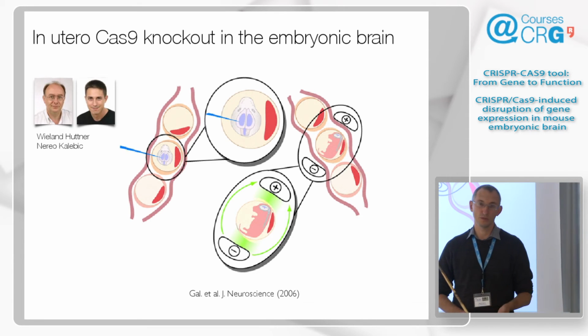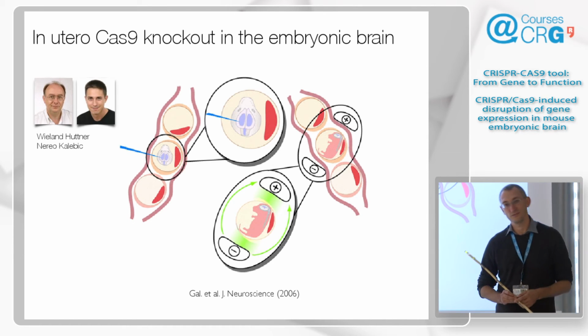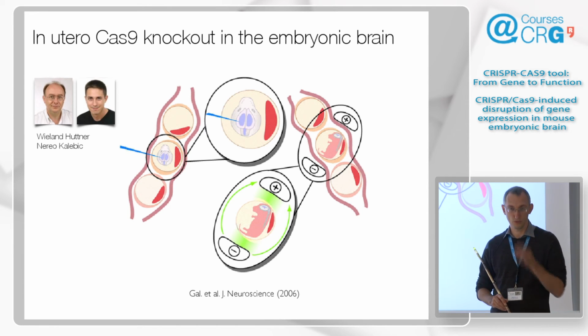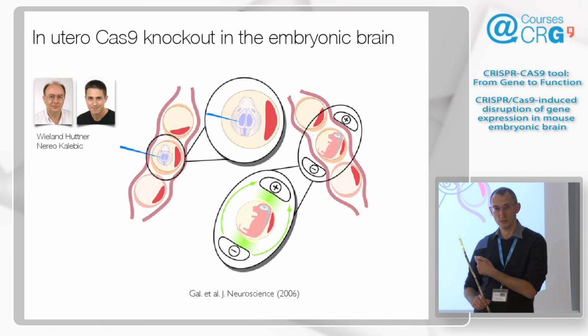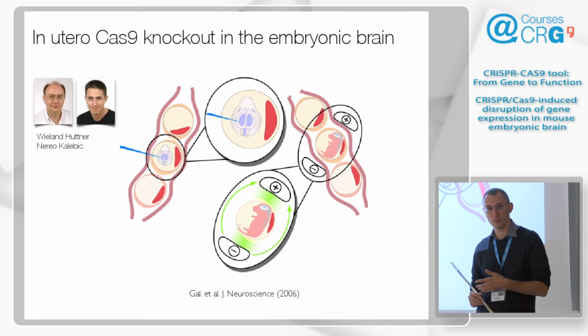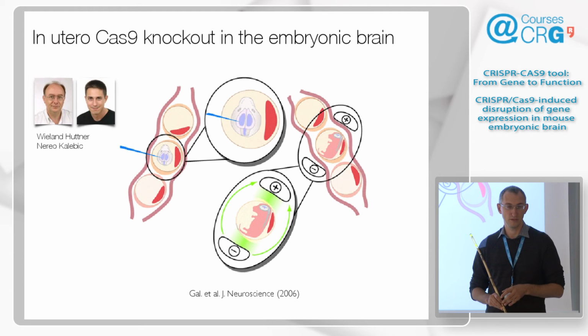Yeah, it's not so easy when it's a point mutation or an oligo template, although oligos also integrate randomly at other positions. And that's definitely still the prudent thing to do, because things like integration at other sites are very hard to identify, also by methods like this, because you align your reads to the reference genome, but you don't know what to expect, and you don't have your target there. You could do it if you want, but it is hard to identify events like that from pure sequence, and Southern is still the best.